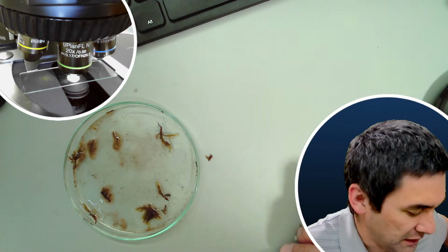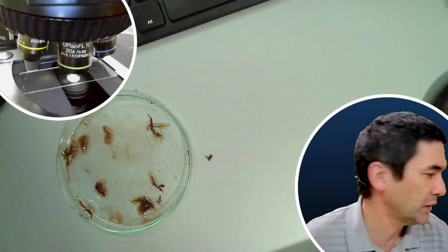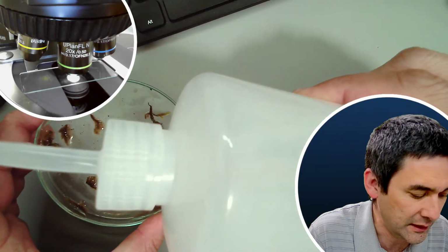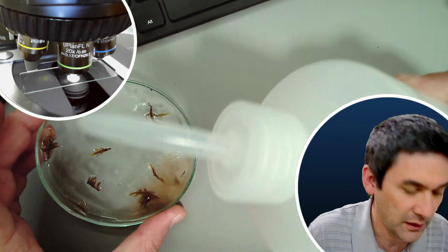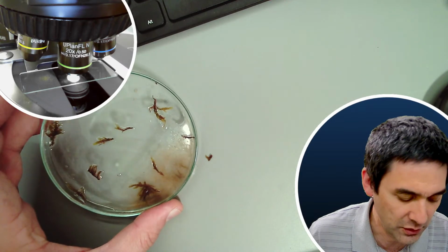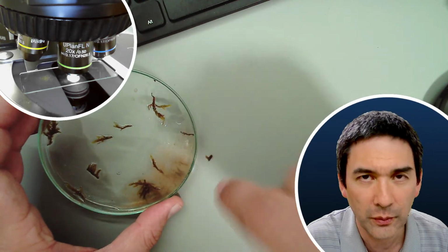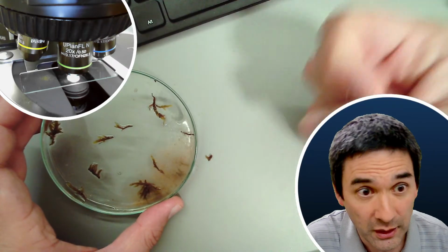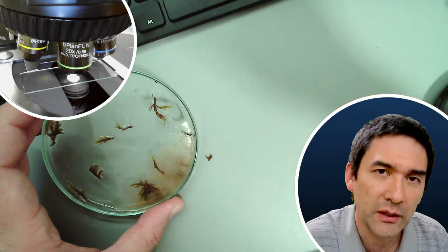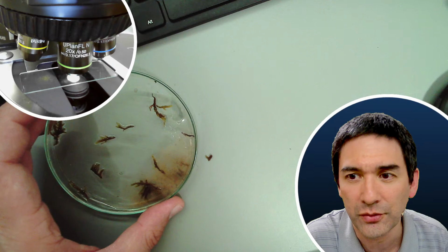So that's simply a thing. Or another thing that you can do is I've got a little water bottle here. You can try to rinse it down like this. Okay. And then you keep it tilted, and you wait for the sediment to settle a little bit, and with it also the tardigrades and whatever other microbes, they might settle down a little bit, and then you can collect some of that from the sediment and put it under the microscope.